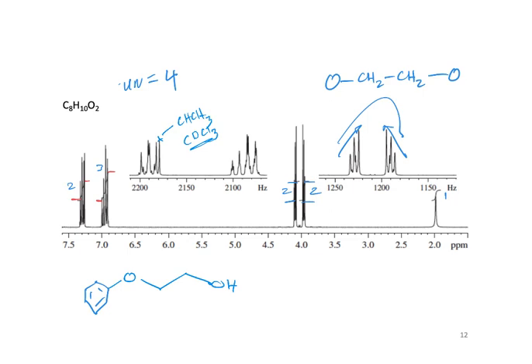These other signals look like they're a little bit second order. So I would say this is kind of like a triplet. So we have some kind of magnetic non-equivalence, like we were talking about. Then we have a doublet here and a triplet under here. I'm saying that partly because I know what kind of symmetry pattern we have.